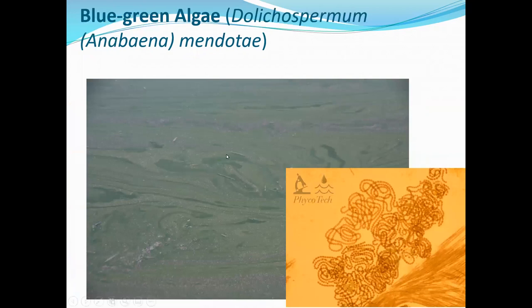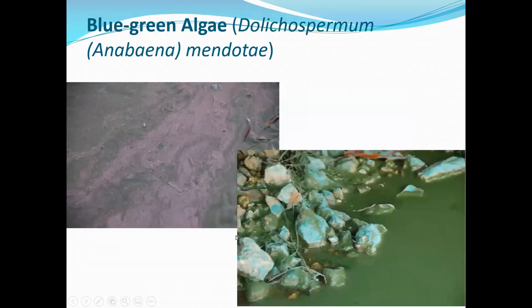And this is Lake Monona, another year. And this is what happens when this stuff dies, this Dolichospermum dies. See this pink here? Remember our two main pigments are phycocyanin and phycoerythrin. Phycoerythrin is the redder one. And also you can get blue-green as well. It looks like somebody actually just scraped stuff up on a rock. And then here's the red pigment. So both of those, and this is at the end of a bloom where the bloom was senescing.